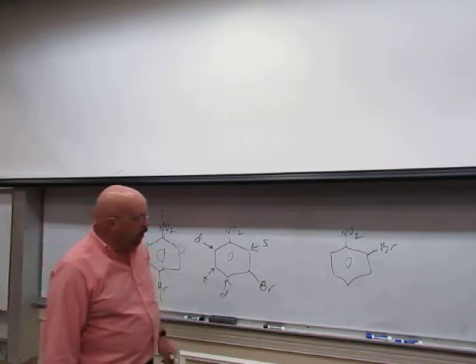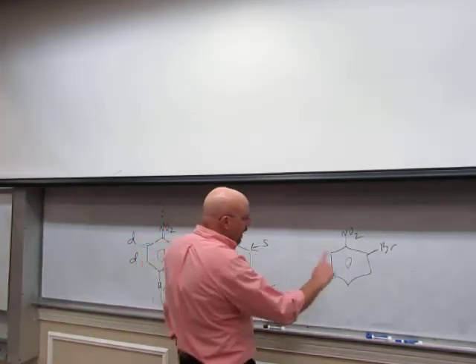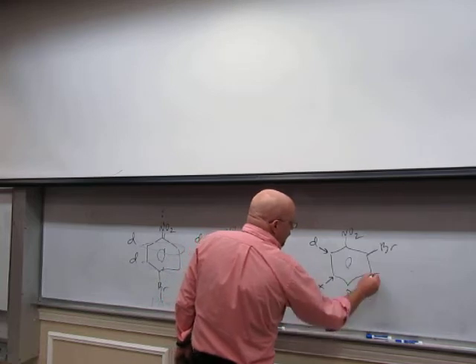If you look at the ortho, there's no symmetry in this one. I would have four signals. This one would be a doublet. This one would be a triplet. This one is a triplet. This one is a doublet.